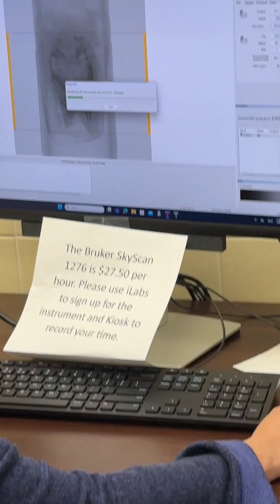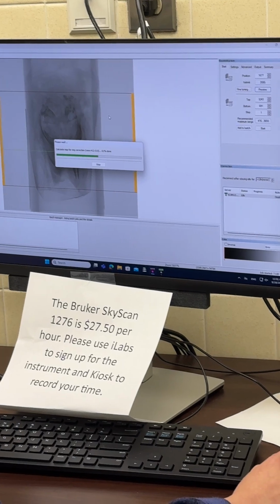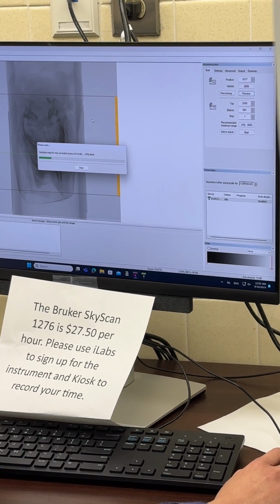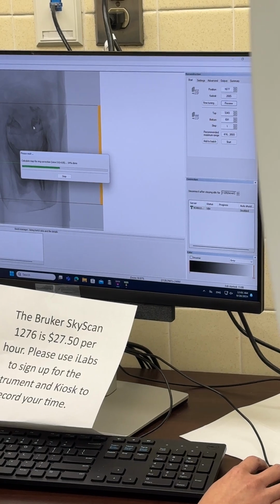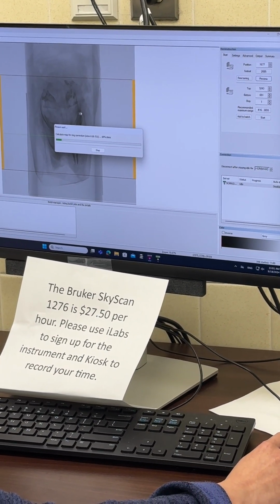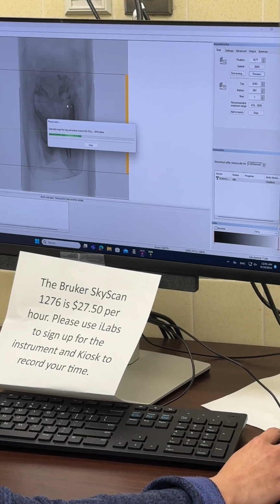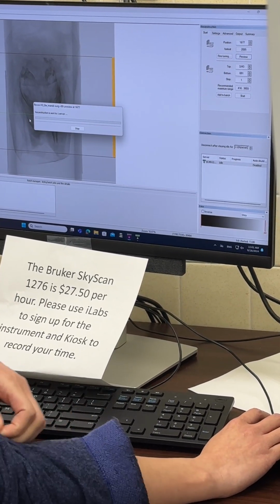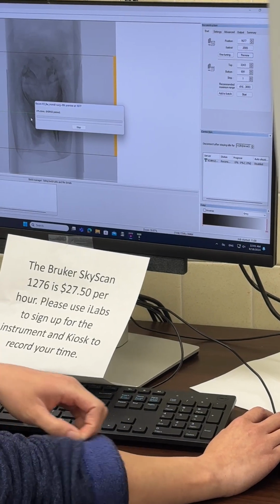So when we're doing the initial preview, you would recommend that we keep the green line right in the center, so it's faster? For normal bone it should be fine, because long bone is pretty similar whether you put it here or here. Okay. But for this one, I recommend you put it at the condyle or this bone part. Okay. Yeah. So that's to say it depends on the purpose. Okay. Yeah. The research purpose.